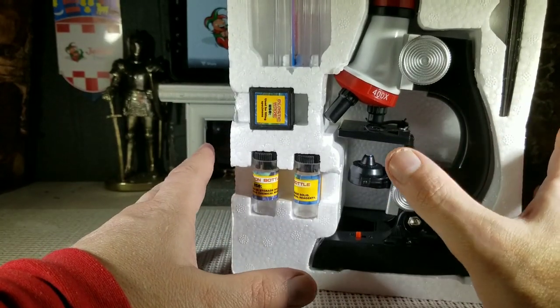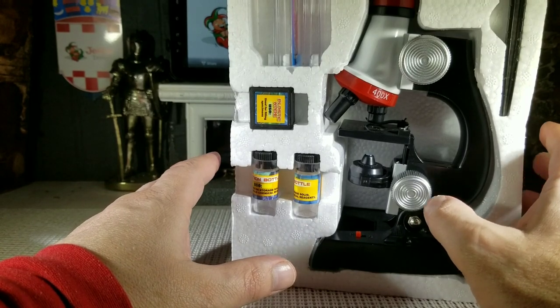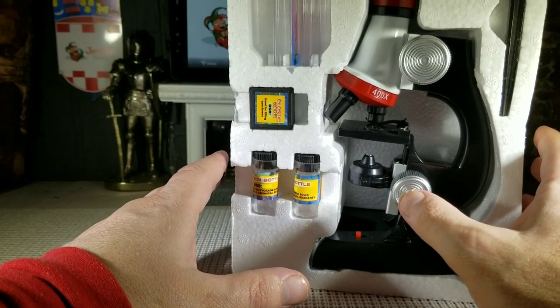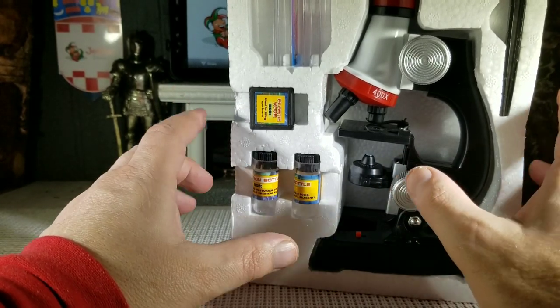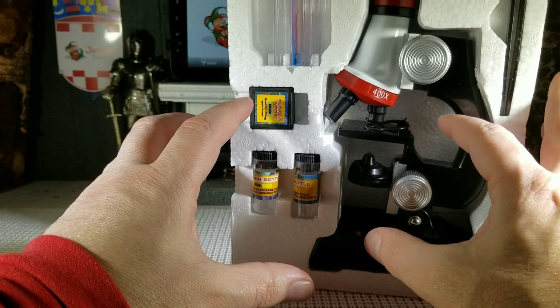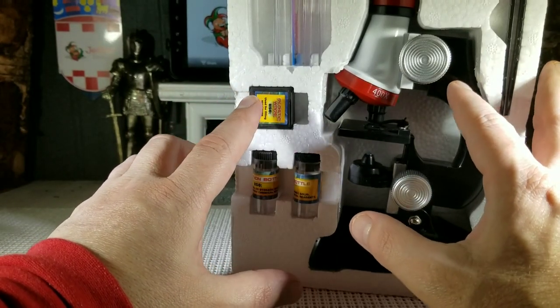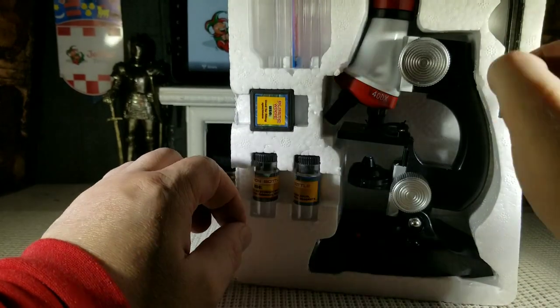Now, this is a toy and it's considered a toy set, so I'm going to be reviewing it as a toy. It definitely is not the grade of a professional microscope by any means — just keep that in mind. But for a toy, it is done very, very well and it does work extremely well.